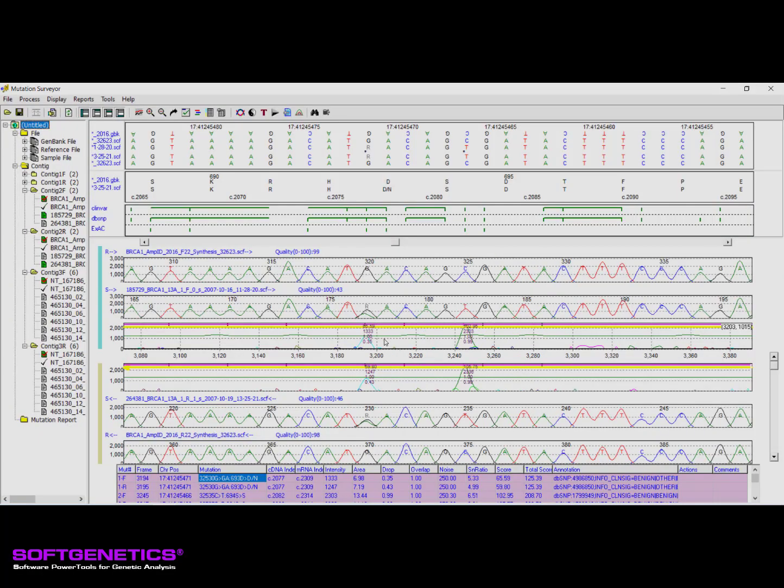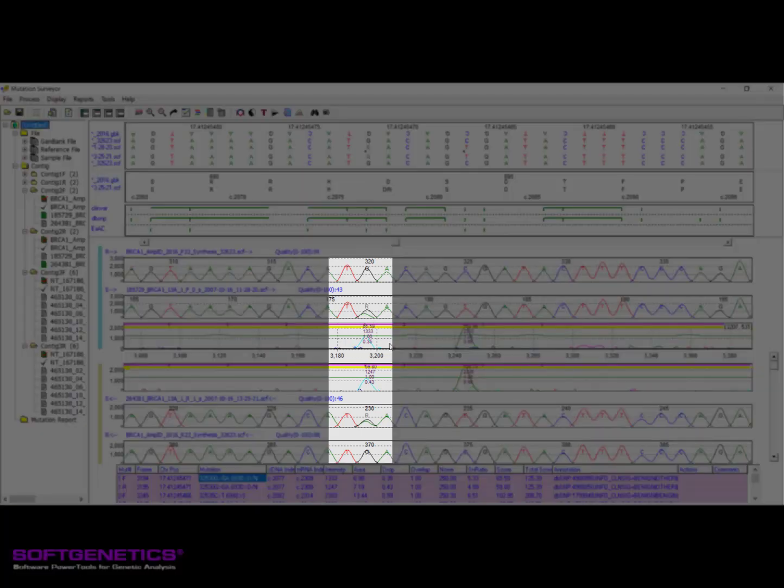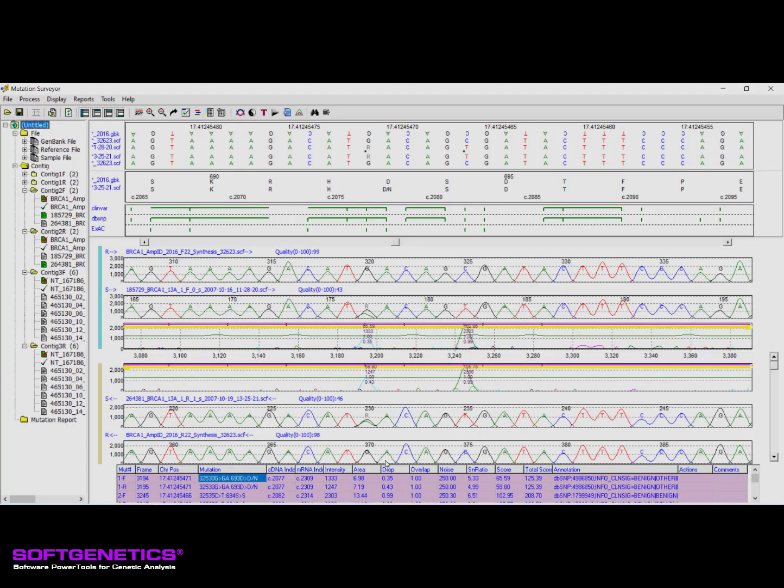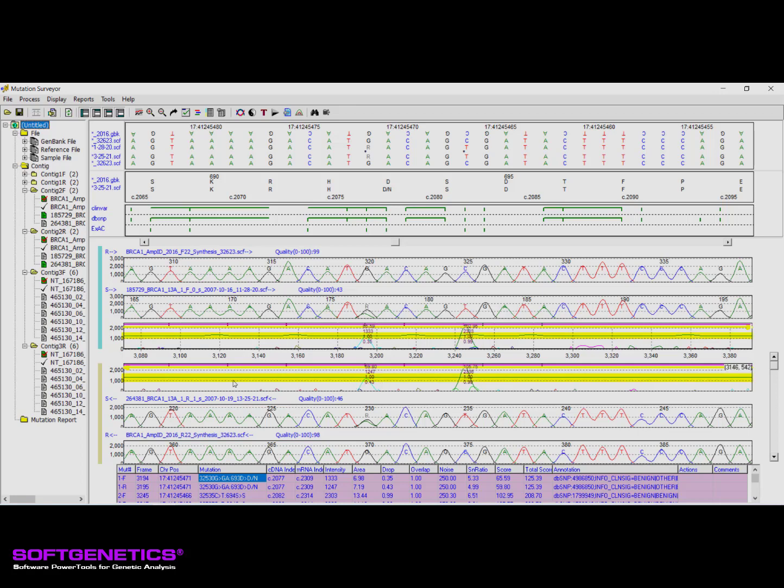Peaks in the mutation trace that appear approximately half this height may be representative of a heterozygous substitution, like we see here. The presence of homozygous insertion and deletion events is monitored and detected through the mobility line, which is the green line running horizontally through the middle of the mutation trace. The mobility line tracks alignment between the reference and sample and fluctuates with changes in sample migration time.